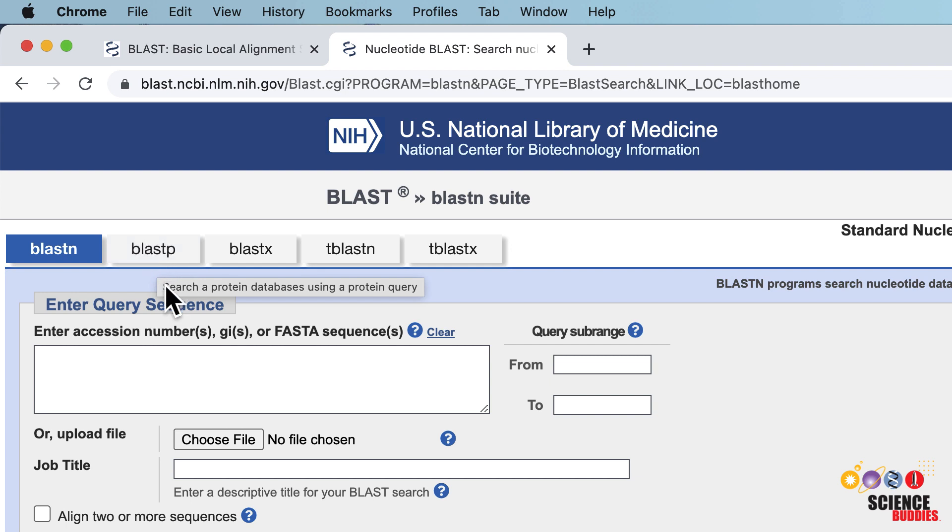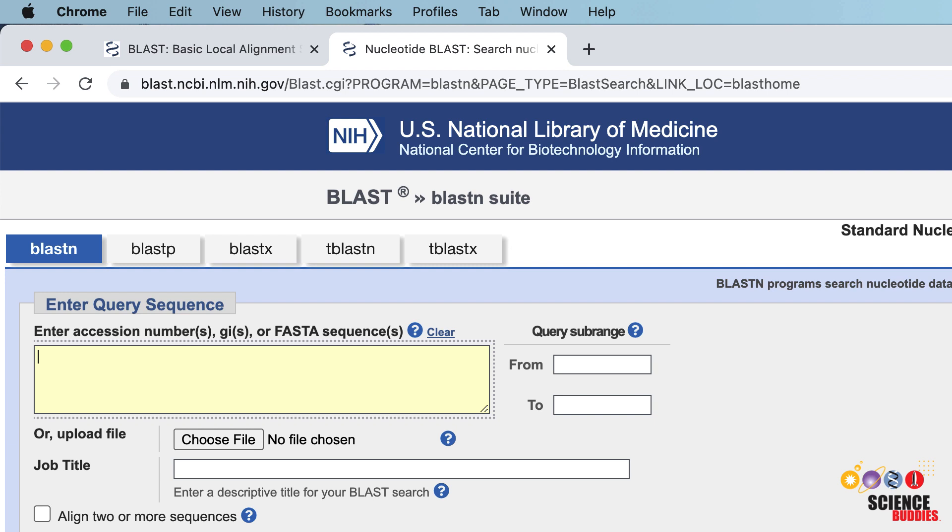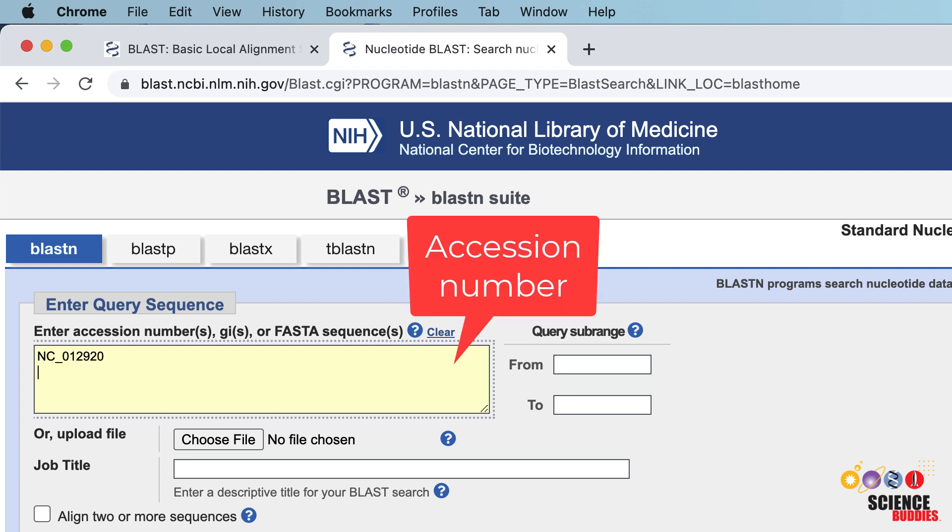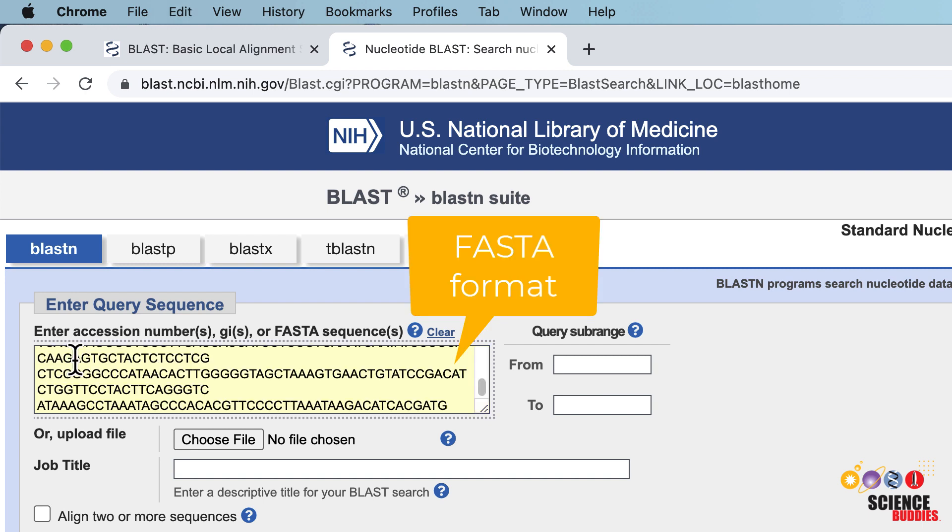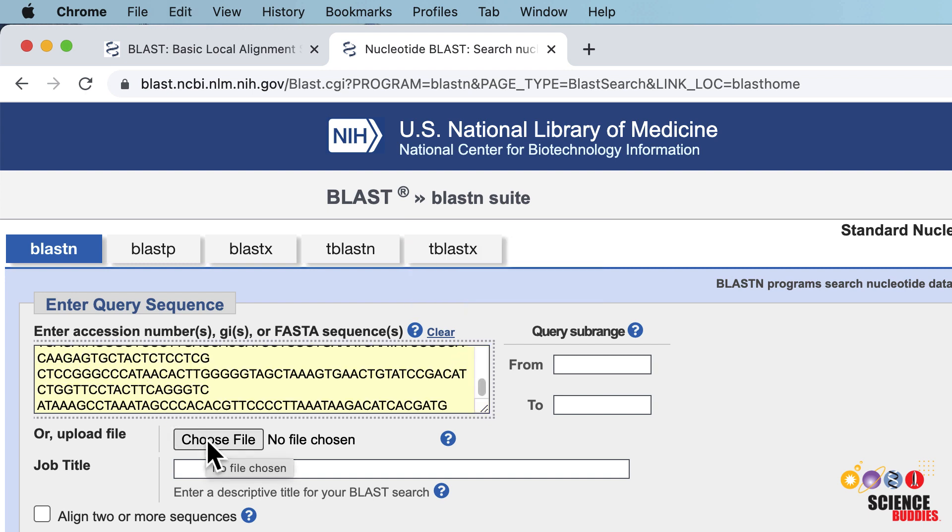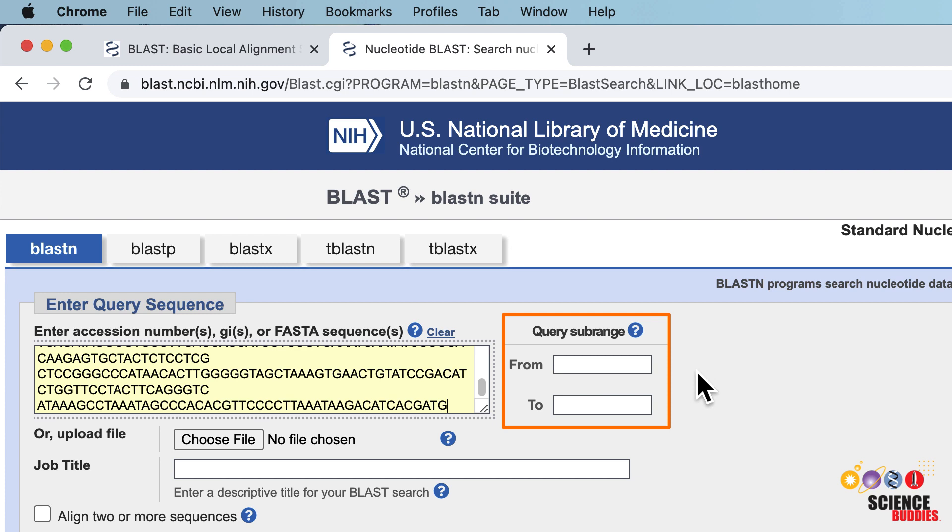In the Enter Query Sequence section, enter your query sequence. BLAST accepts different types of inputs such as the sequence's accession number or a sequence in FASTA format. You can also upload a sequence from a file.